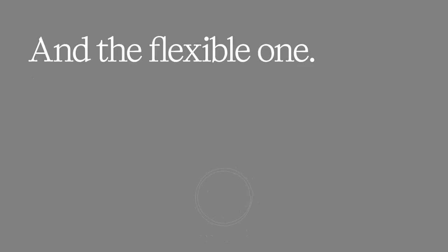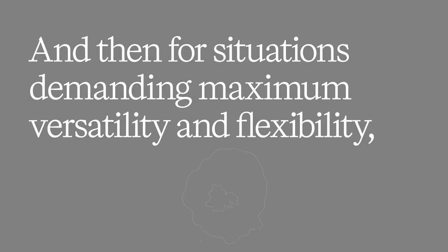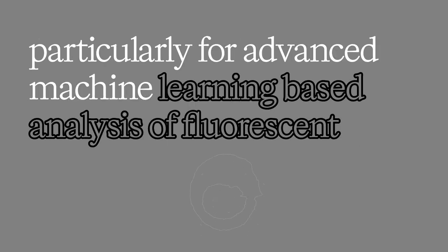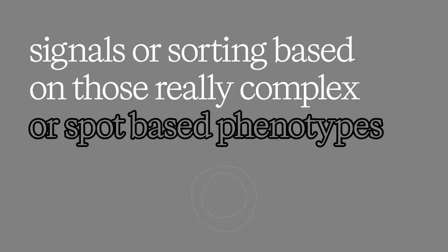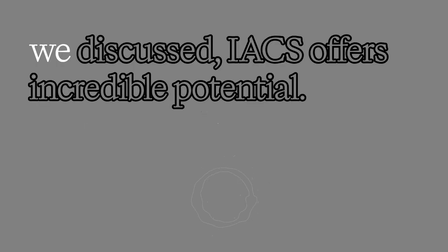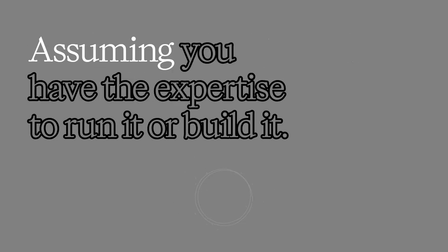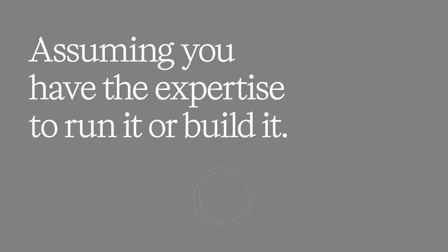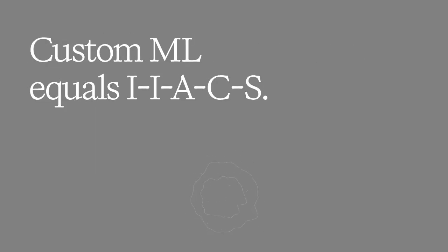And the flexible one. And then, for situations demanding maximum versatility and flexibility, particularly for advanced machine learning-based analysis of fluorescence signals, or sorting based on those really complex or spot-based phenotypes we discussed, IACS offers incredible potential, assuming you have the expertise to run it or build it. Flexibility, fluorescence, custom ML equals IACS.